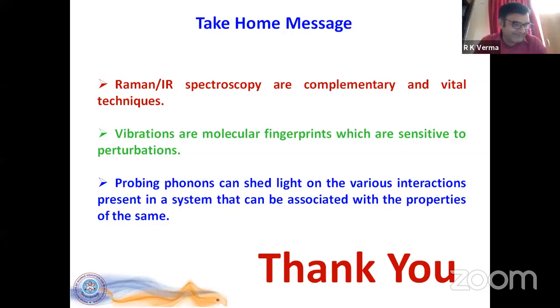Avinash has written, sir, XRD measured from different diffractometers, such as PANalytical, Rigaku, Seifert, etc., gives the same structural pattern for a compound, whereas Raman measurements from different laser sources give different patterns. Why is it so? Very good question. First of all, if we're talking about the vibrations, the phonons of any given crystal lattice, I would say that even if we change the laser wavelength, I would not a priori expect any change in the vibrational frequencies. But it depends on the context.